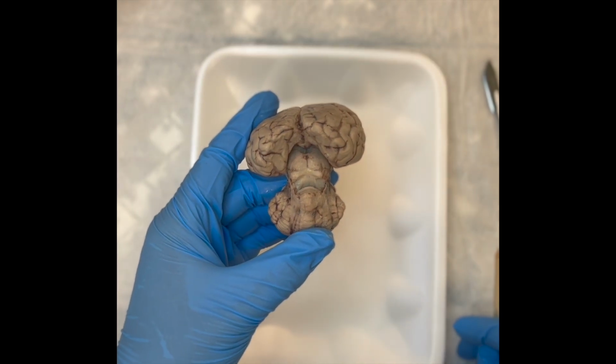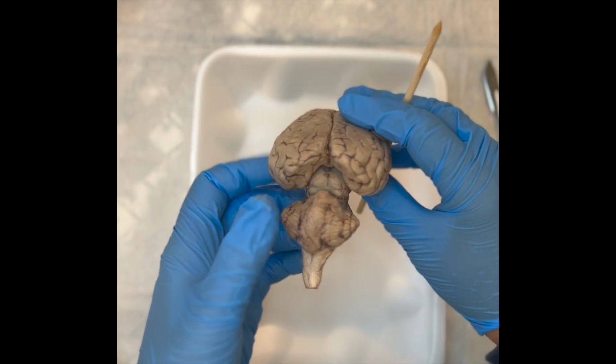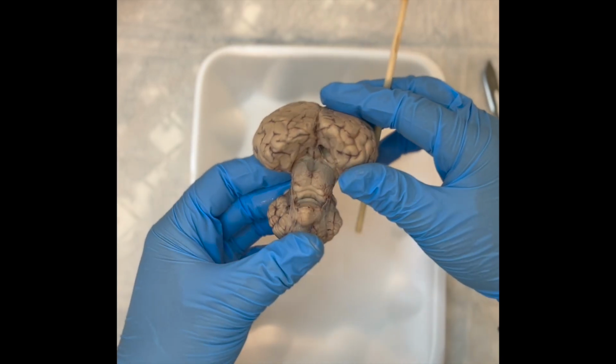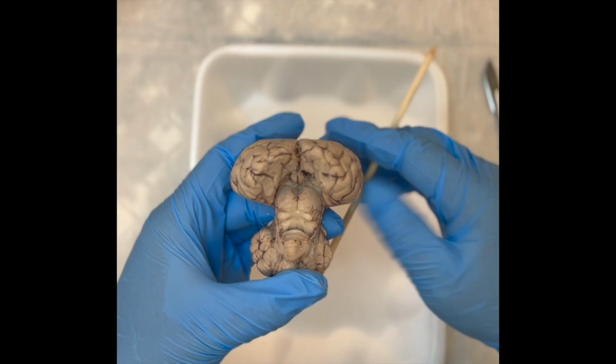You want to be careful. You don't want to just completely rip it off, but you need to be aggressive enough that you are seeing the separation and you get to see these cool features on the inside.